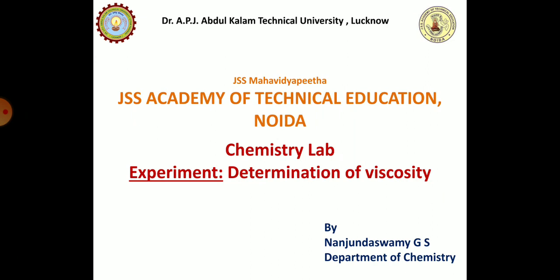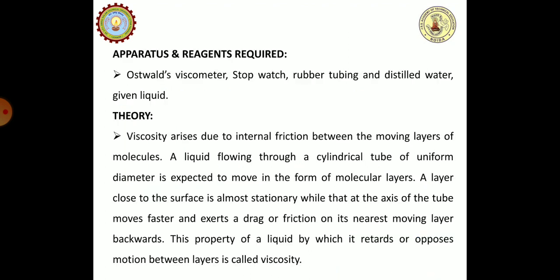In this lecture I am going to explain one of the experiments in the chemistry practical lab, that is the determination of viscosity of a given liquid. For that, what apparatus is required to perform that experiment?